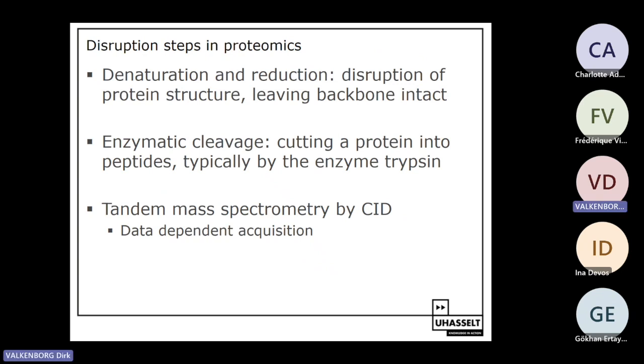But there are some connections in that protein that are very firm and strong, and that is what we call disulfide bridges. These disulfide bridges we need to break. But it is nature: if you break them and leave them in solution unchanged, they will form the disulfide bridges again by themselves. It is self-assembling, perhaps in the wrong way, but again you are left with these firm bonds. So we don't want that.